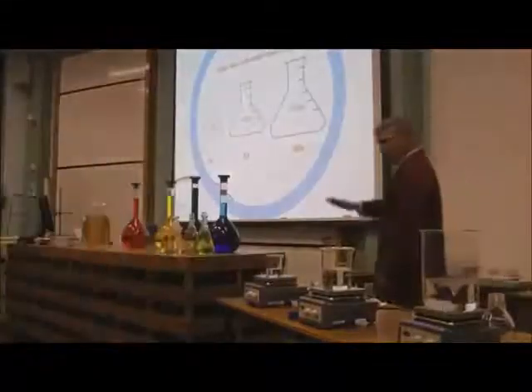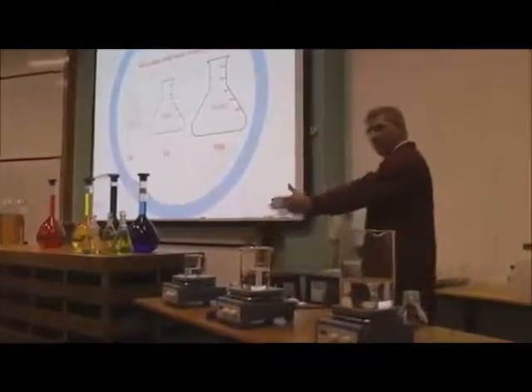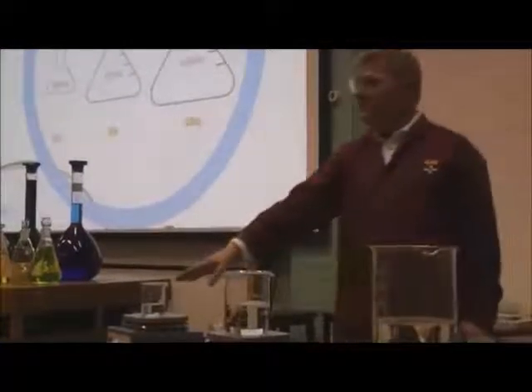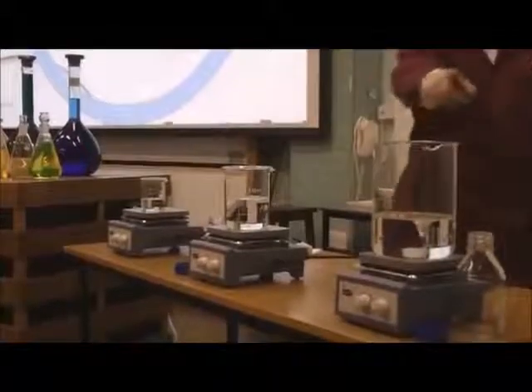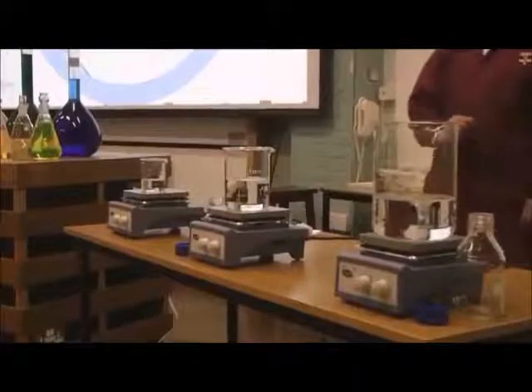The question I want to ask the audience is, this one is 5 times as big as that, this one's 10 times as big as that. Say this one takes 50 seconds, how long is this one going to take? Well, show of hands, is this going to take longer to react than this one? How many people think this one will take longer?